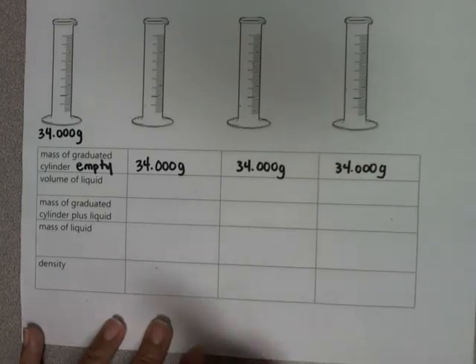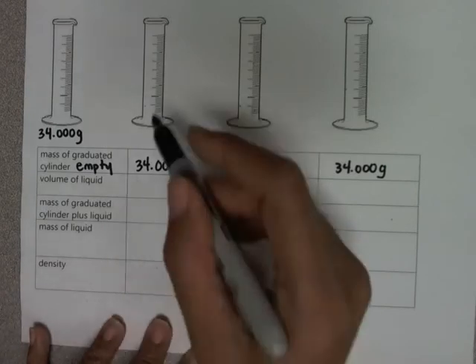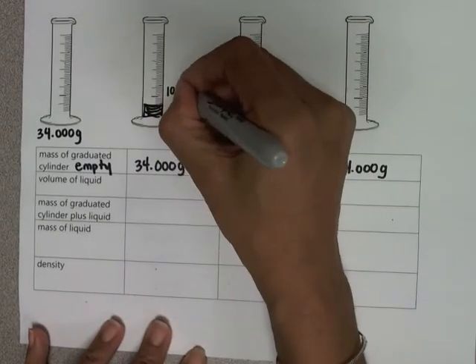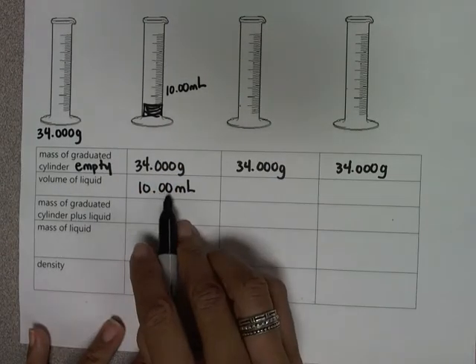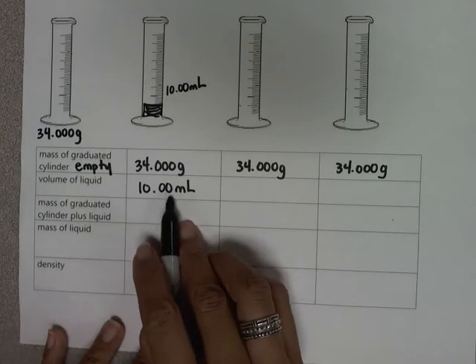Okay, now I add some liquid to the graduated cylinder, and I add 10 milliliters to start. And notice that I put 2 decimal places for this volume because the graduated cylinder on Late Night Labs gives us 2 decimal places. So even though they're zeros, I'm still listing them.